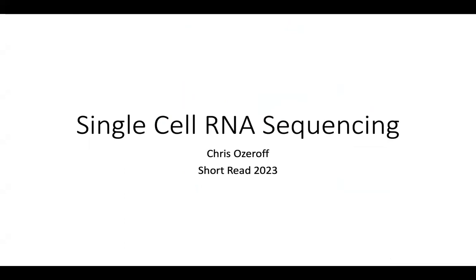Hello. In this video, we will briefly discuss single-cell RNA sequencing and the 10x Genomics platform. We will then talk about the R program Seurat, which we will use to analyze our single-cell RNA sequencing data. This will be an introduction to the work you will be doing on day 8 of the short read workshop.